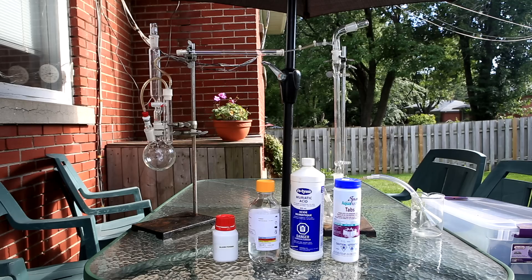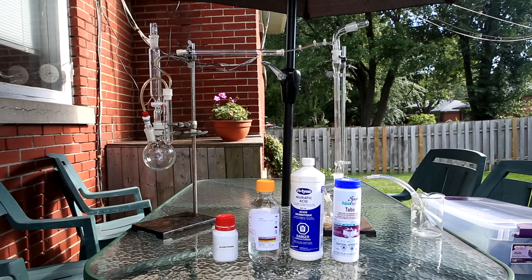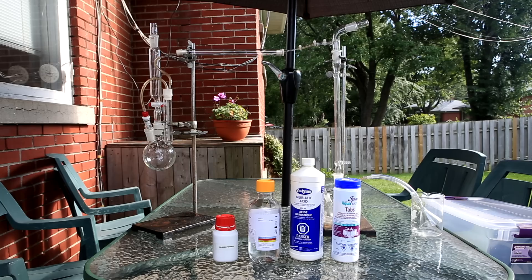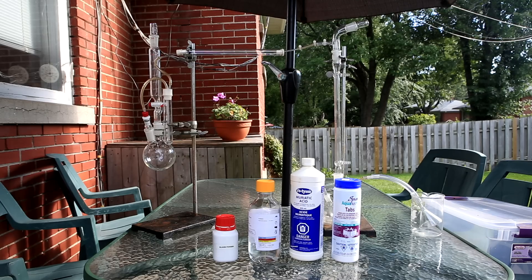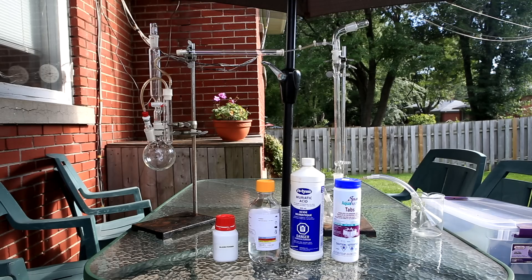This is the setup I used to make my silicon tetrachloride. I needed sulfuric acid, silicon powder, muriatic acid (also known as hydrochloric acid), and some chlorine pool tablets. The amounts of each were somewhat arbitrary — I just made sure I could generate more chlorine than the silicon I had. I used 10 grams of silicon, which was overkill because according to my yield I only used at most two to three grams of it.